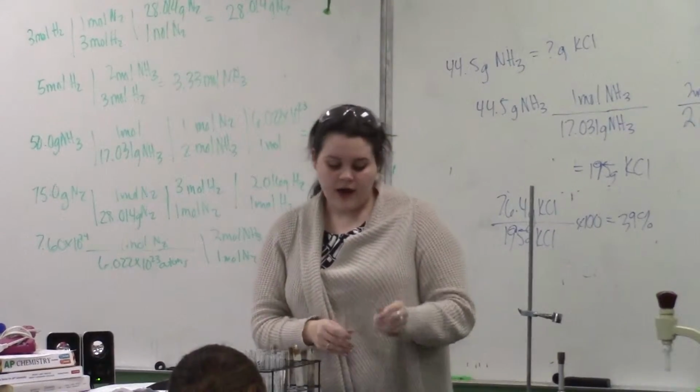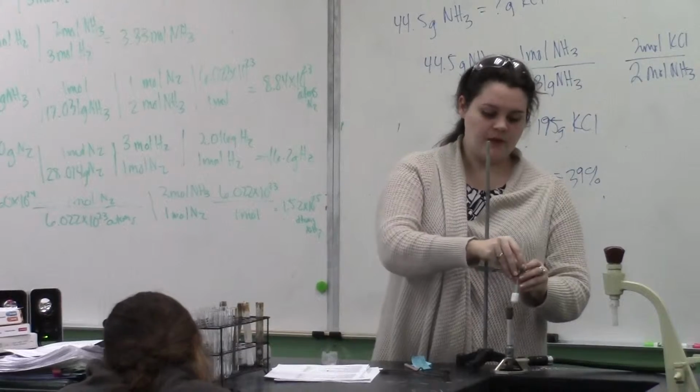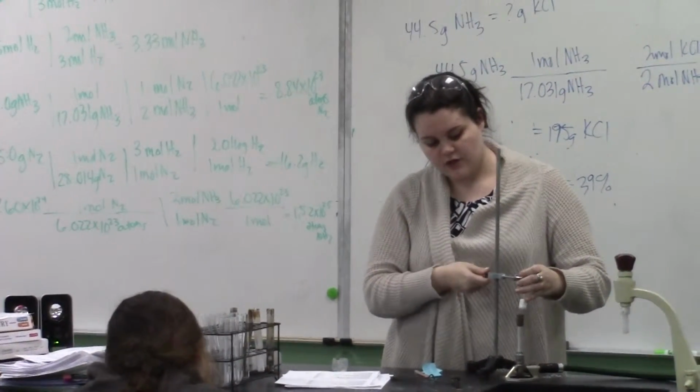Okay, so I have measured out 5 grams of potassium chlorate in here. It is going to take a minute to heat up and get where it needs to be, so I'm going to go ahead and start that.